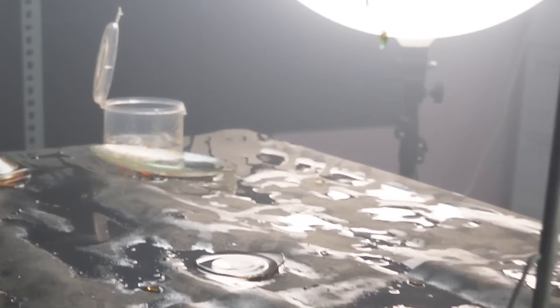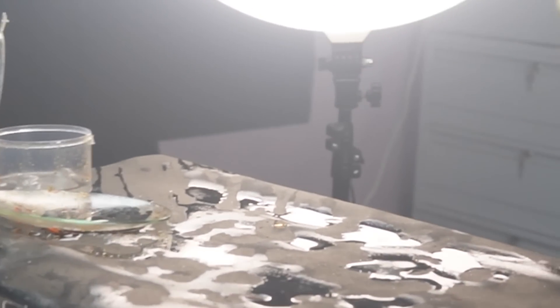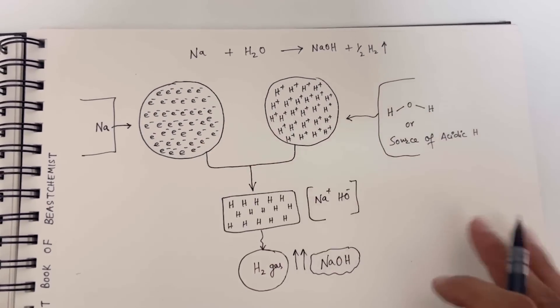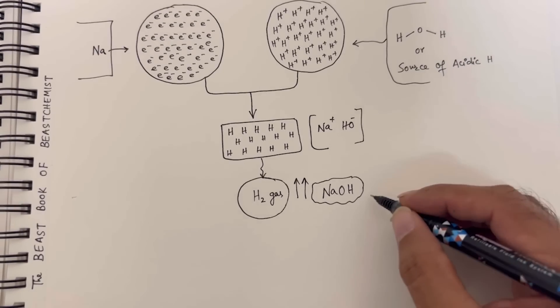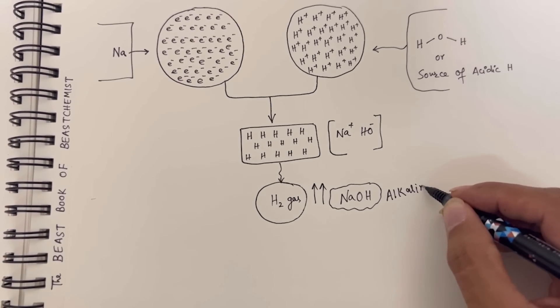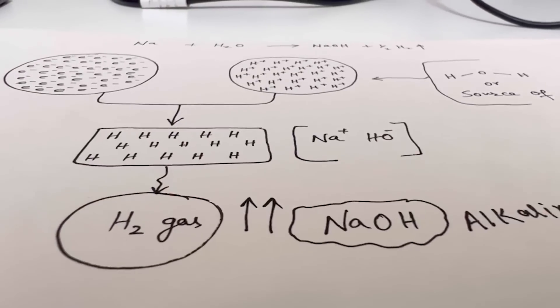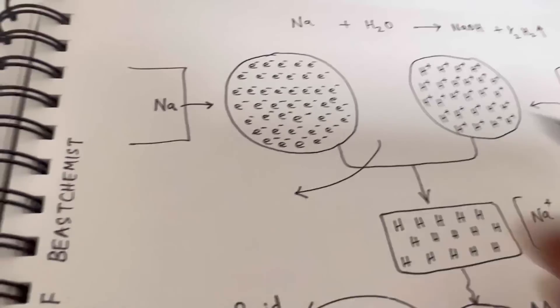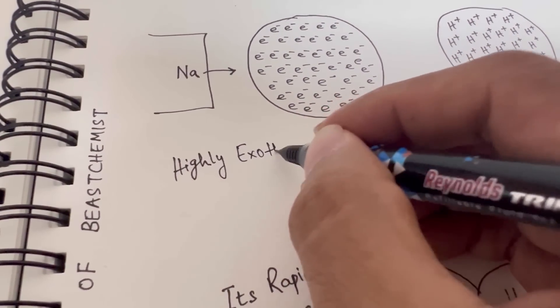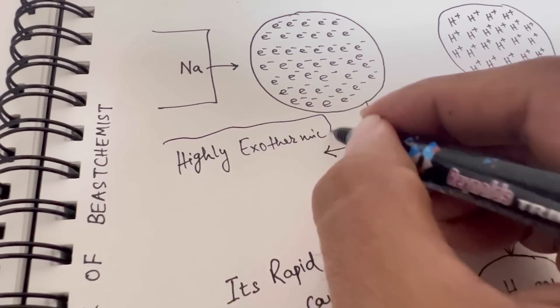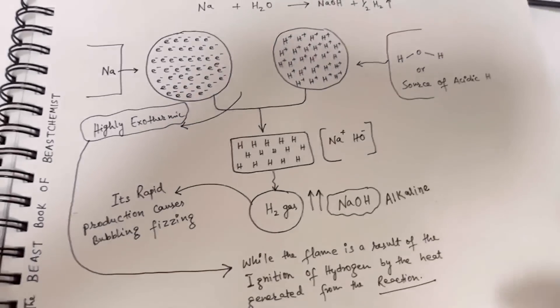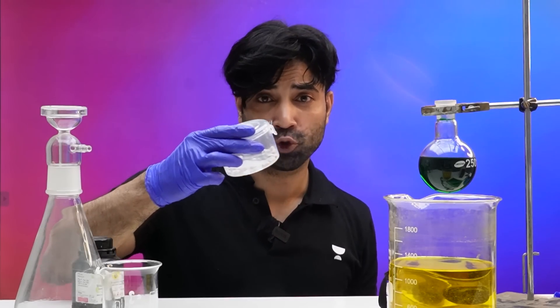After the destruction, this is the condition — but what exactly is happening? As the sodium reacts with water, it releases hydrogen gas and forms sodium hydroxide, a caustic alkaline solution. The rapid production of hydrogen gas causes the intense bubbling and fizzing, while the flame is a result of the ignition of hydrogen by the heat generated from the reaction.